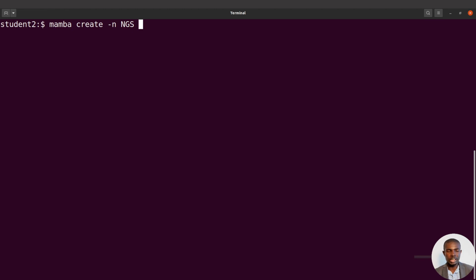And I'll specify channels. I'll say -c bioconda, -c conda-forge, and then -c defaults. These are the channels I'll use. And then I'll specify the tools. So I'll start with Trimmomatic. And then I'll use BWA, I'll use samtools, and I'll use Seqtk.